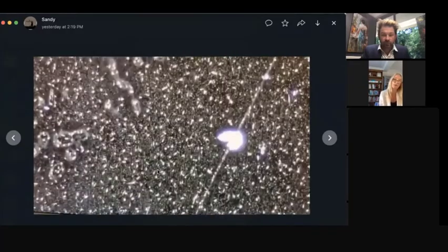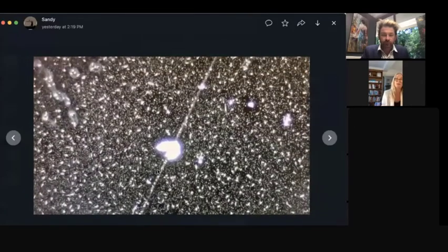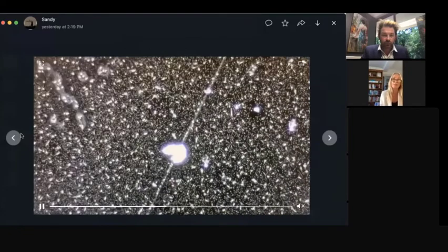Usually I'm looking at blood. Maybe I'll keep blood on the slide for a couple of hours, sometimes even 24 hours, and we just see if there's any pleomorphism, see what develops within the blood, because we're looking at how healthy the interstitial tissue is, how healthy that plasma is, really, what comes out of cells. It's amazing what happens when you leave blood for a while. But I've never seen structures like this develop in any other solution. In a good way.